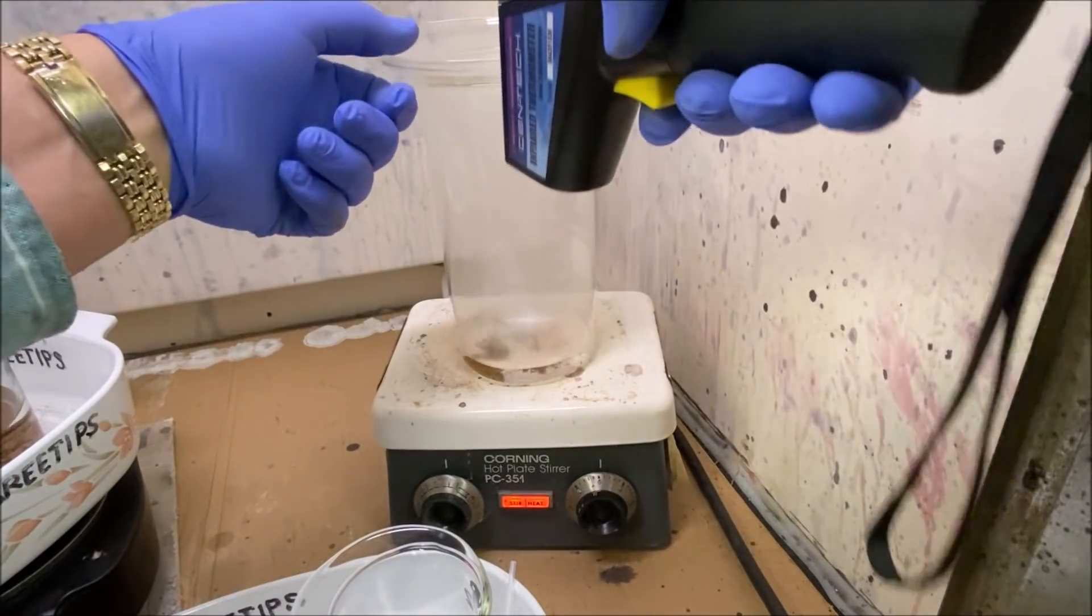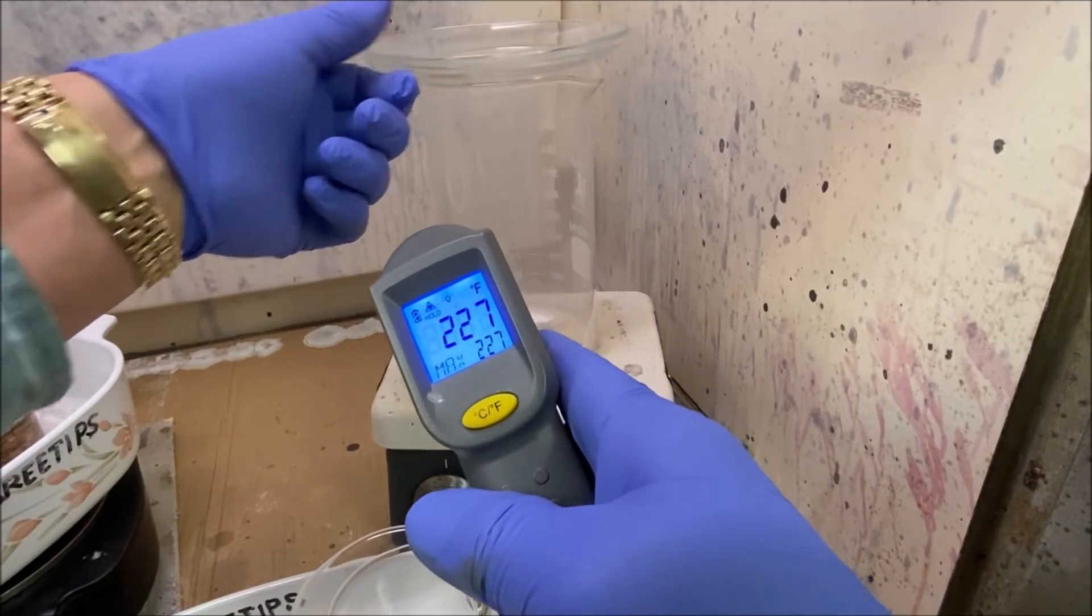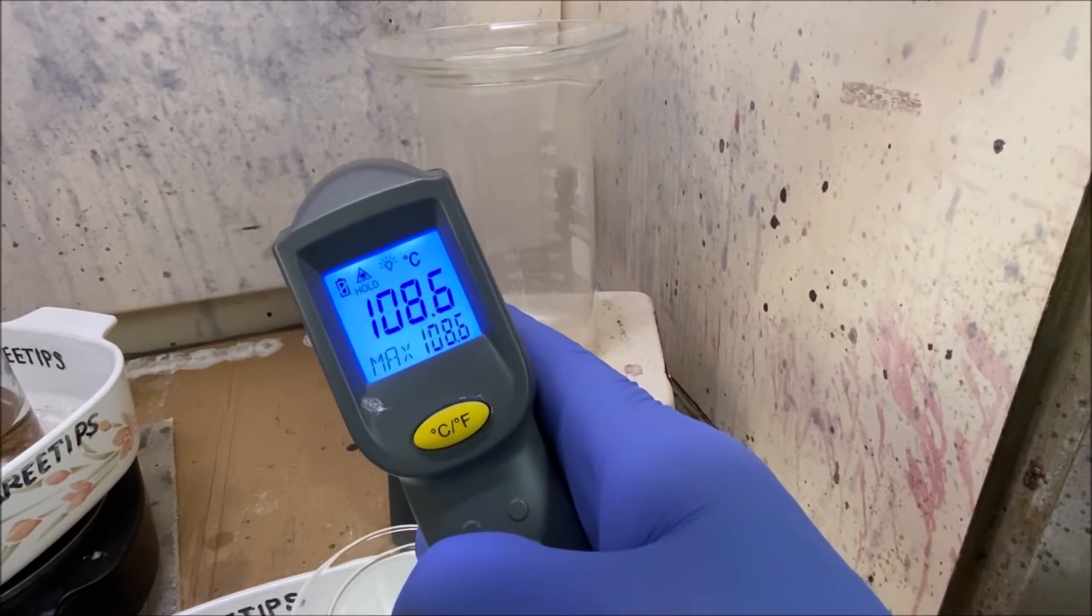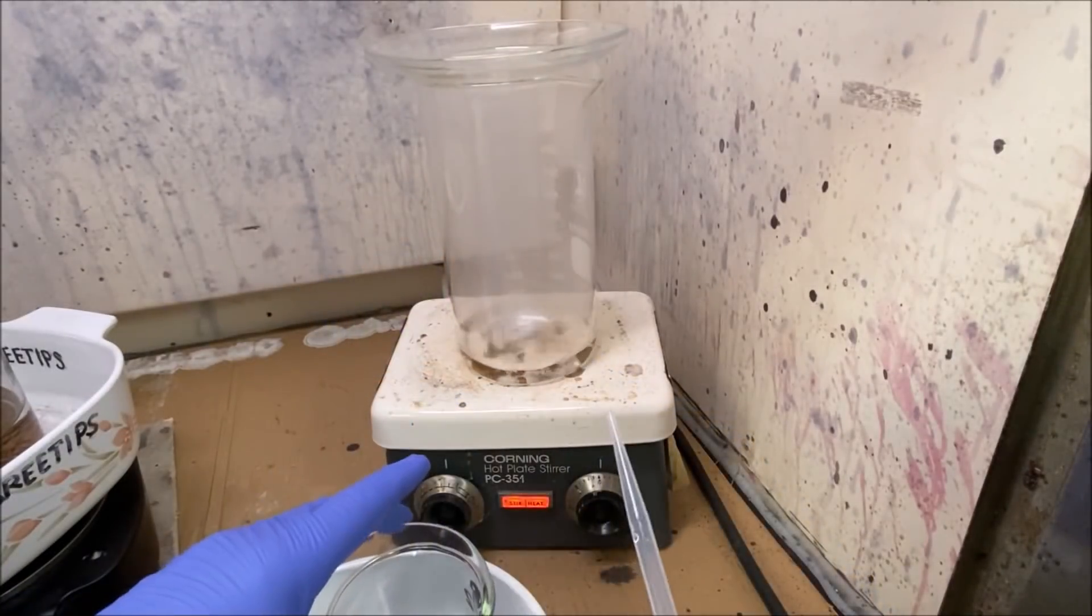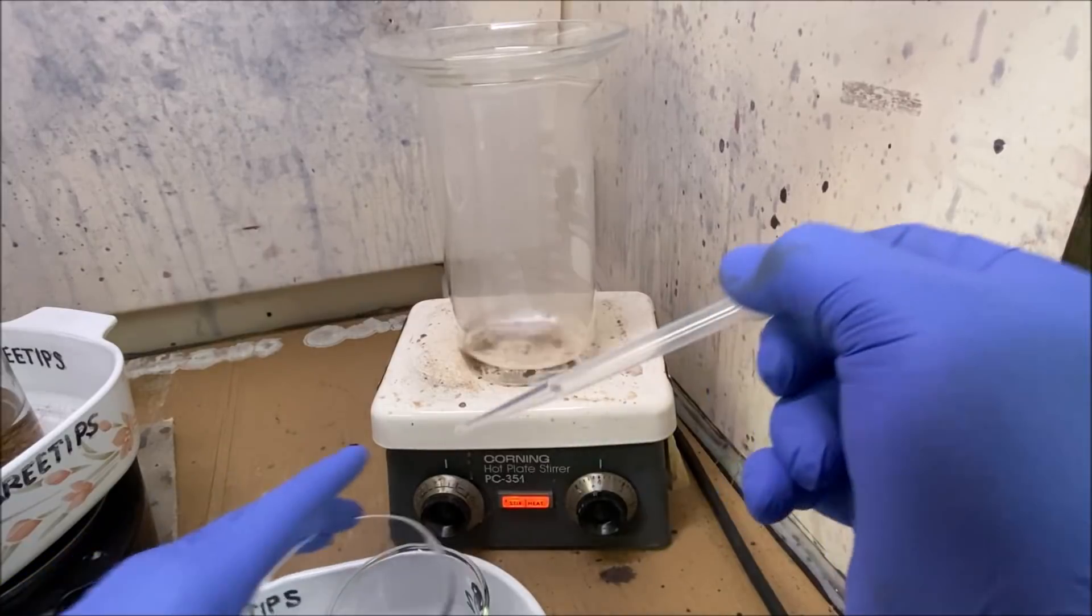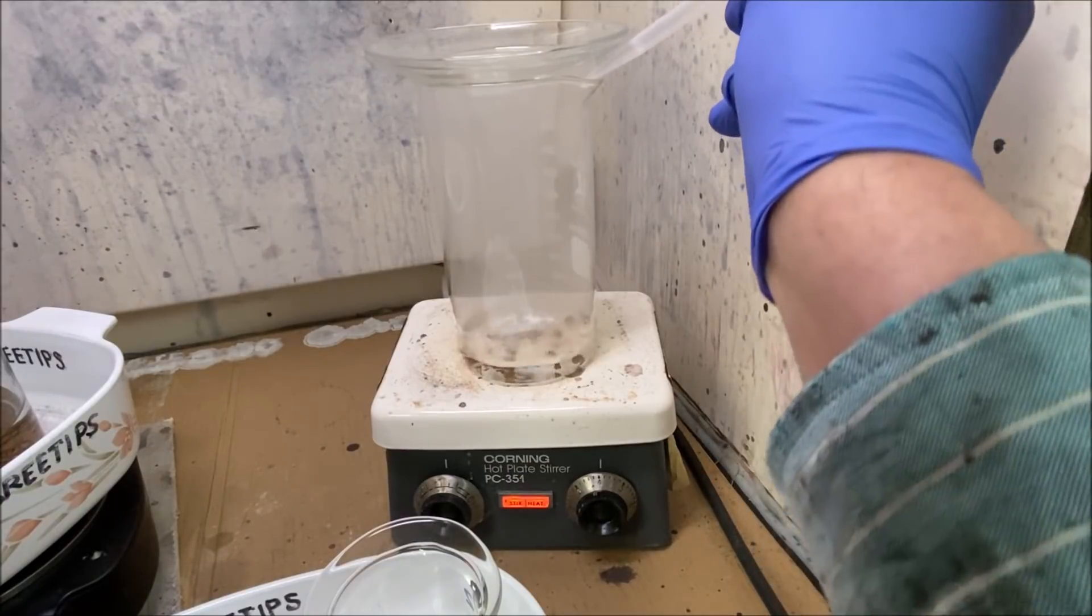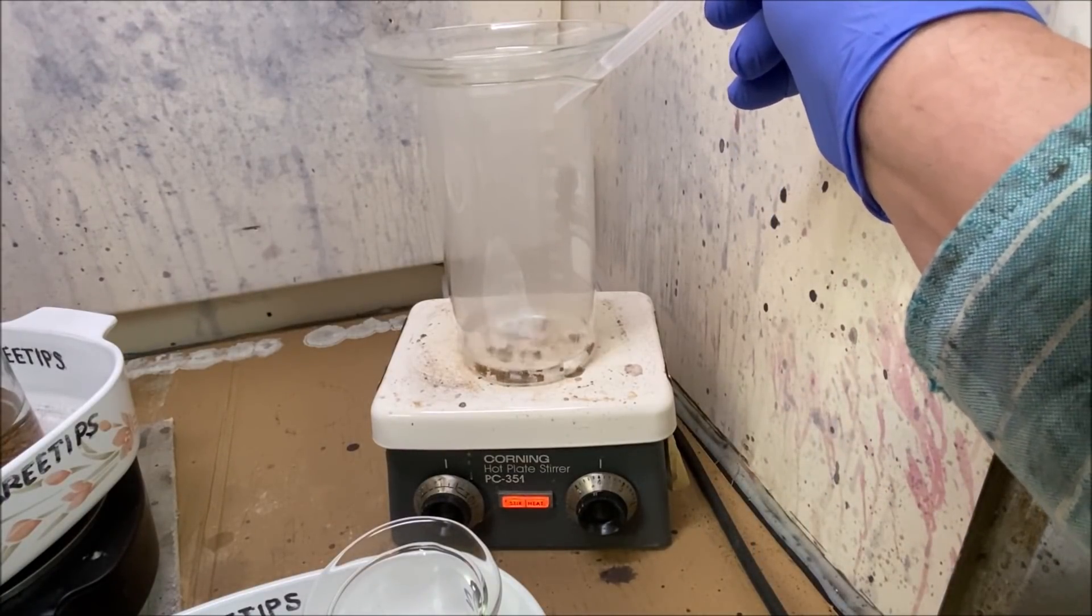It's been on here for about 10 minutes now. I've got 227 Fahrenheit, 108.6 Celsius. All right, I'm going to add a little bit of the 29 percent hydrogen peroxide, maybe a half a milliliter, just one drop at a time. I don't know how this is going to react.